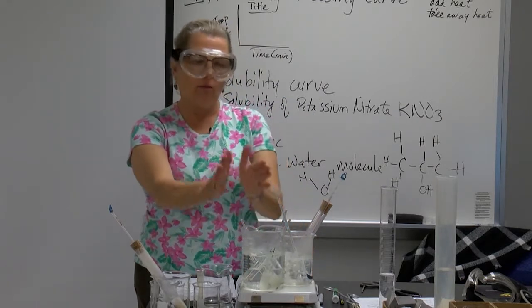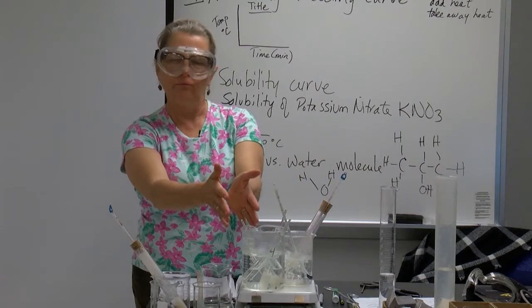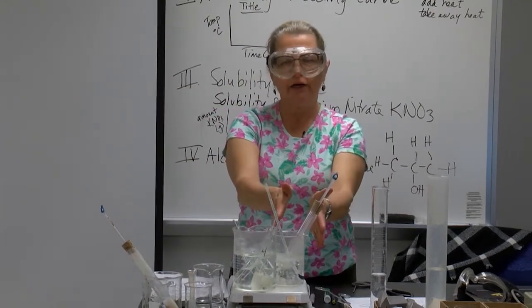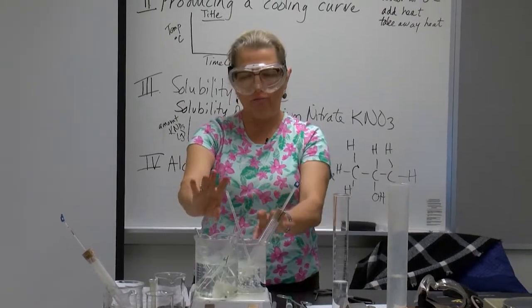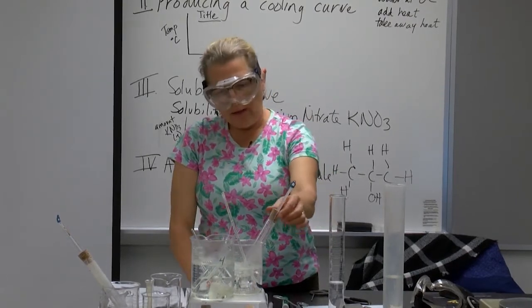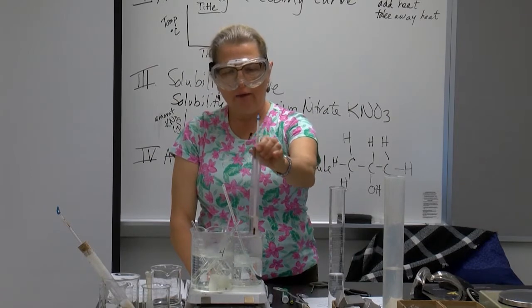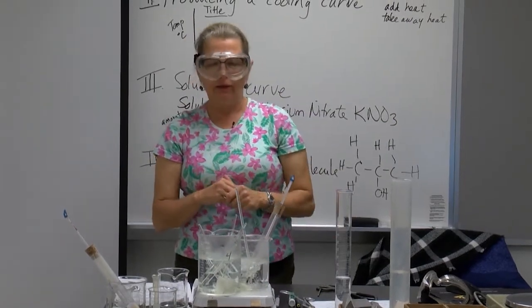Anyways, with this we will generate a solubility curve. And with this we are going to generate a cooling curve. You will be graphing data from both of these. Now, this one, as you can see, is almost completely liquid. We need to wait until it's completely liquid.